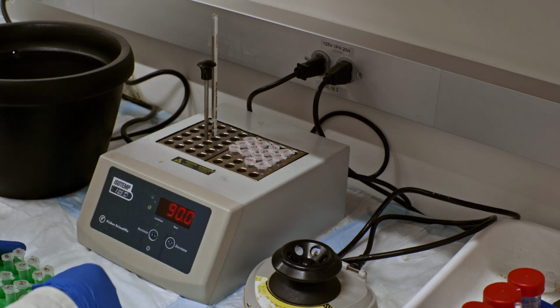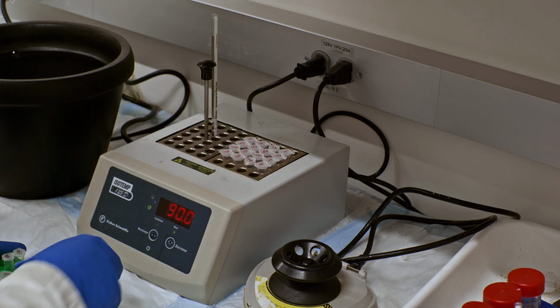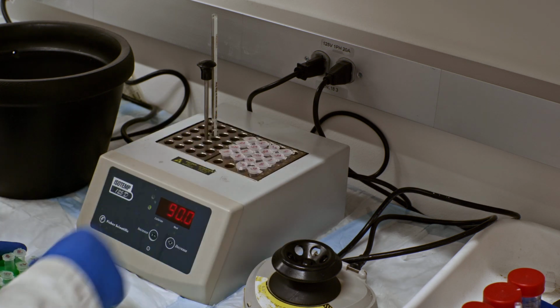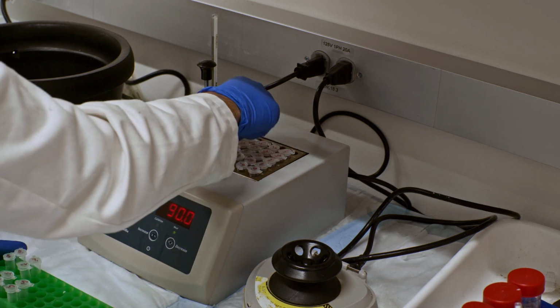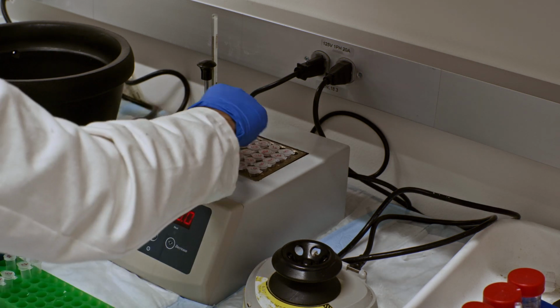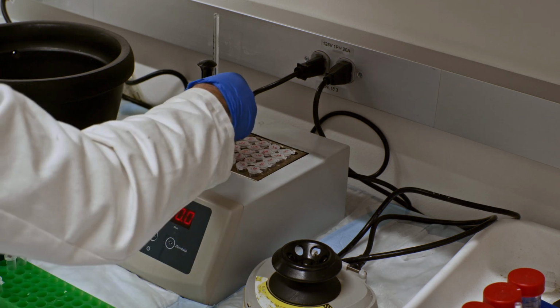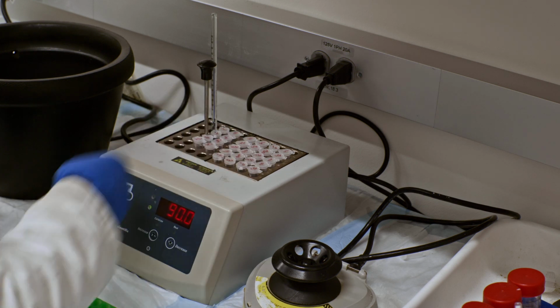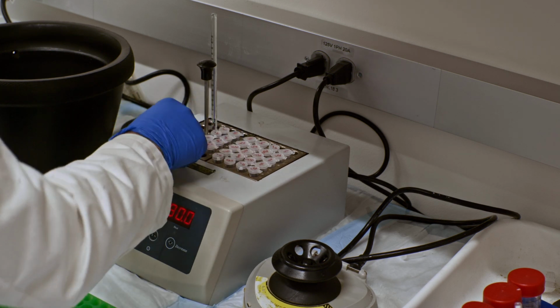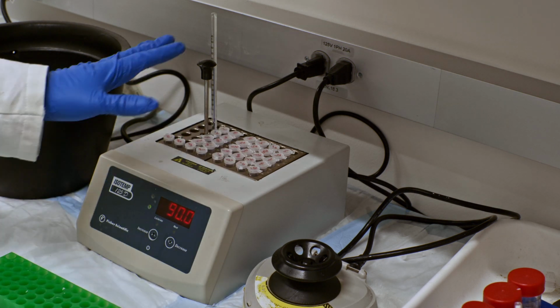During those 5 minutes, you can go to your gel and wash the wells, which is really important because whenever you're making these gels, some of the polyacrylamide solution can still hang out in the well, and they have a different viscosity from your actual samples. And whenever you try to put a sample into a well that's not clean, your sample just kind of flies out of your gel. As your samples warm up, go back to your gel, stop the current, open it up, and just wash all the wells.